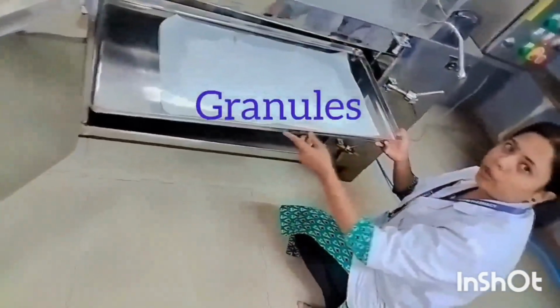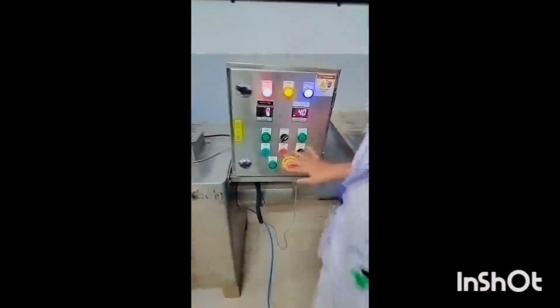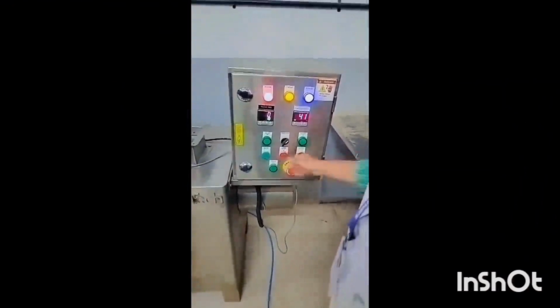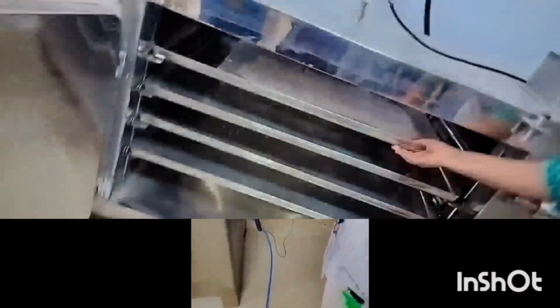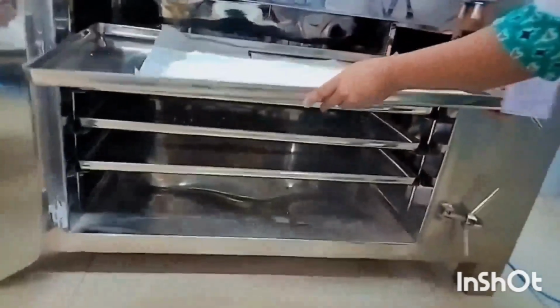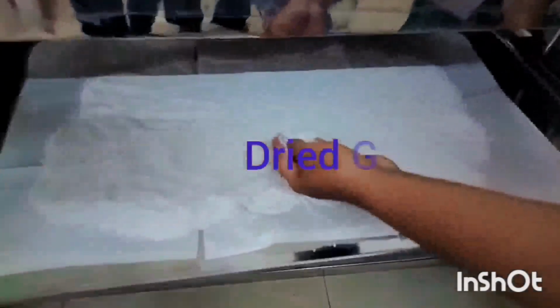These are the granules we are going to dry in the tray dryer. Now 10 minutes have been completed, so we'll stop the motor and switch off the heater. As you can see, the granules are dried completely.